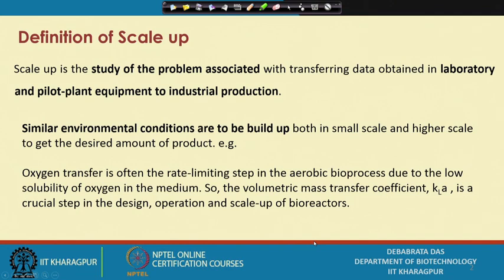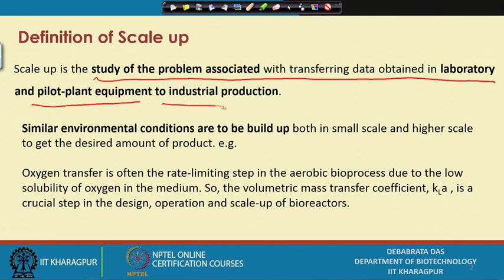the definition of scale up. The definition of scale up is the study of the problems associated with transferring data from the laboratory to pilot equipment to the industrial production. What I want to tell you is that we cannot use the operational conditions we have in the smaller reactor directly in the bigger fermenter. So the operating conditions will be changed to maintain a similar type of environment. So this particular scale up deals with that.